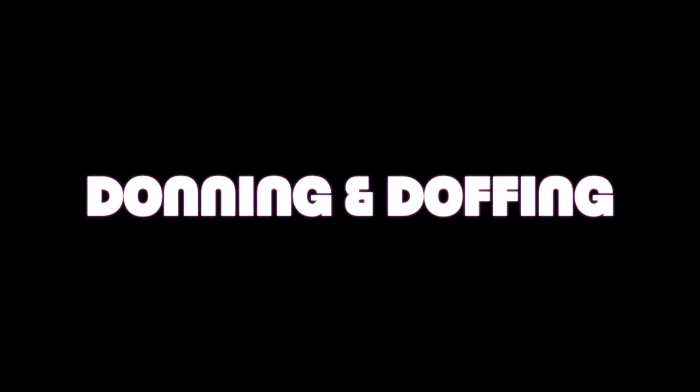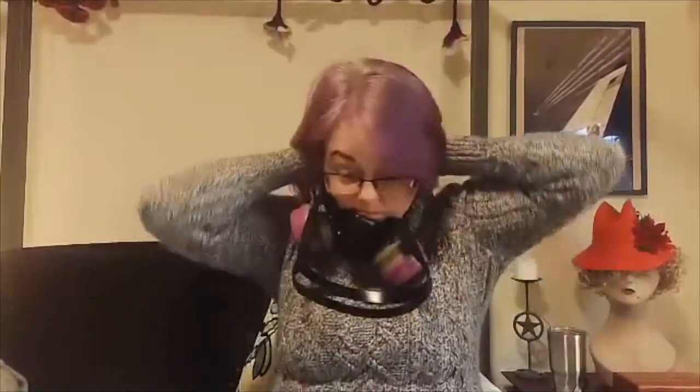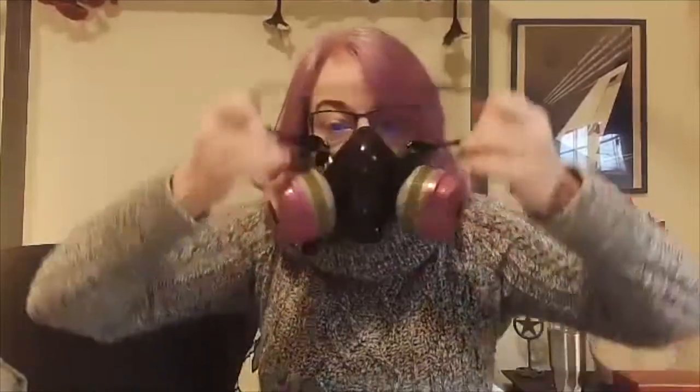Now that we've got our cartridges screwed on tightly — but not over-tightened, we don't want to strip the threads of the attachment point — the respirator has a head strap that goes behind your head and a neck strap that goes behind your neck. First, take your neck strap and hook it behind your neck so that if you take your respirator down as soon as you come out, it's hanging around your neck. Then take the head strap, position it up over your face, and adjust it to be as tight as possible without discomfort.